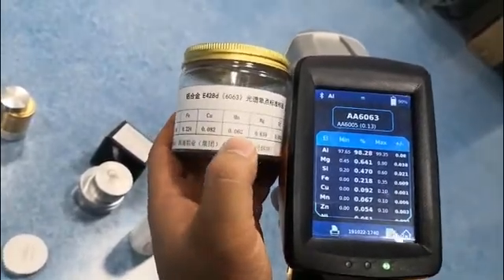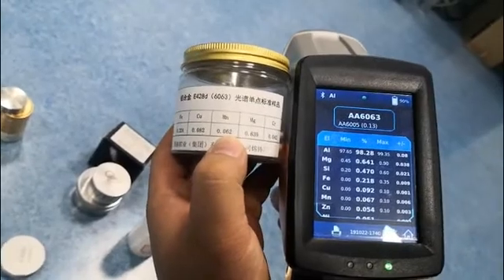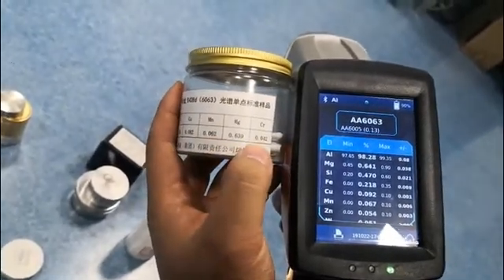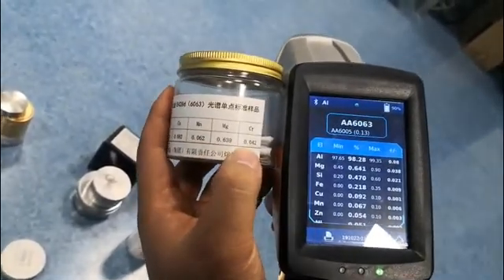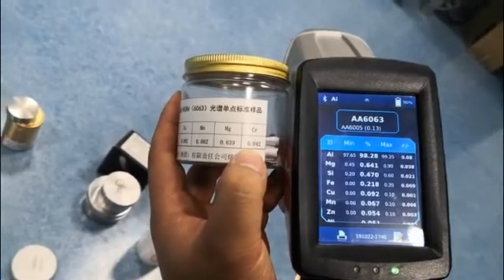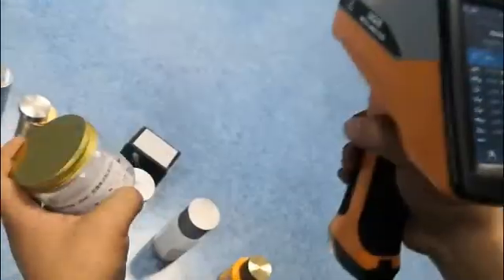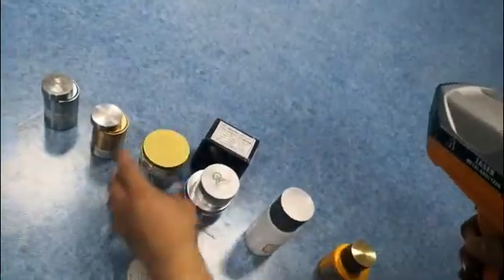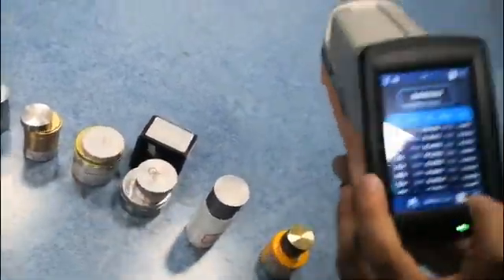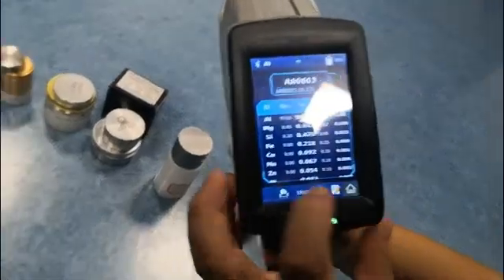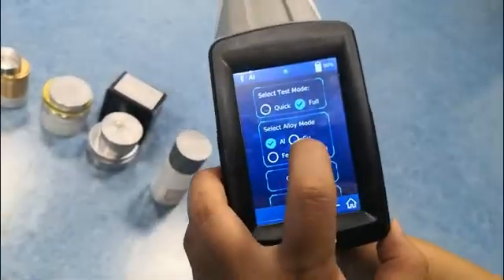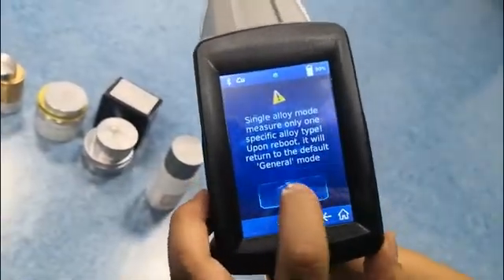Cooper and then, okay, you can see the accuracy and hot. Okay, now we move to copper base.